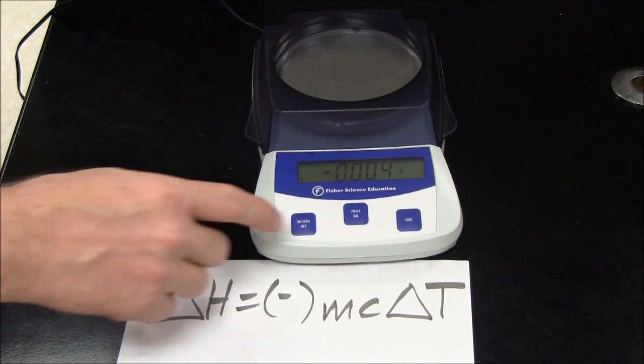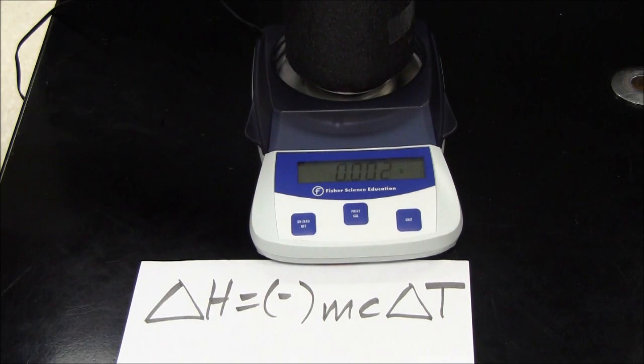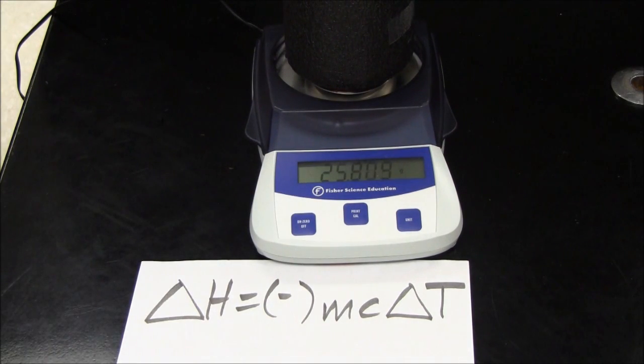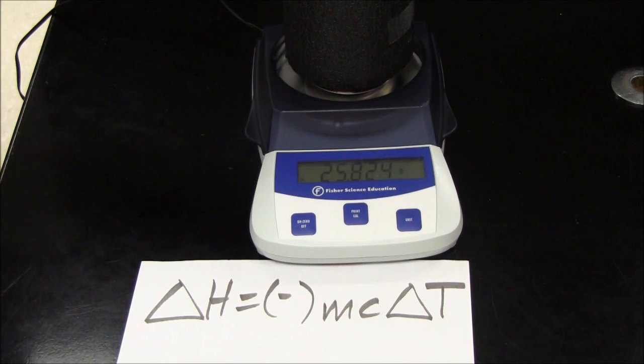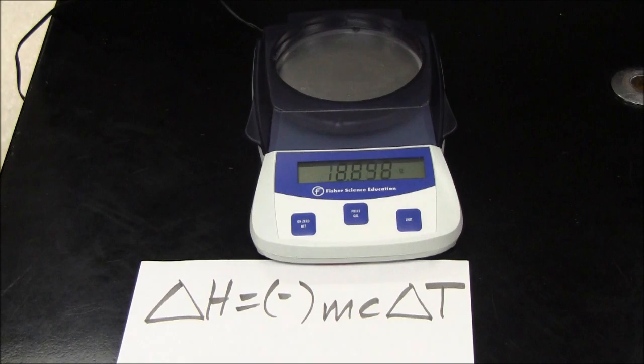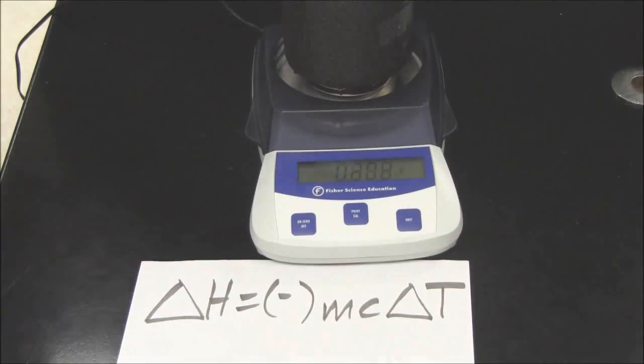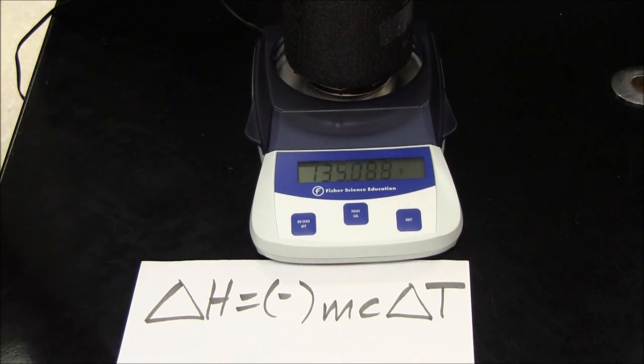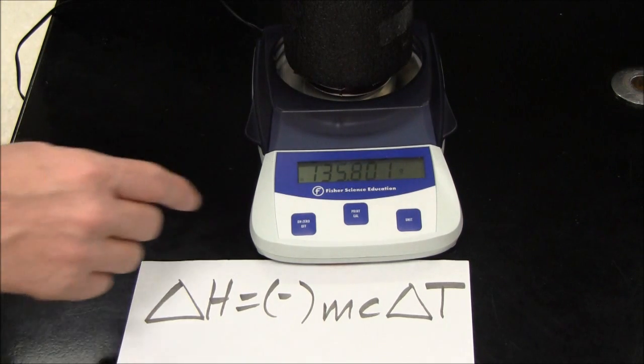So let's mass the calorimeter. All right, that's the mass of the calorimeter, now let's add some water. So this is the mass of the calorimeter with water in it. So the difference in those two masses is obviously the mass of the water.